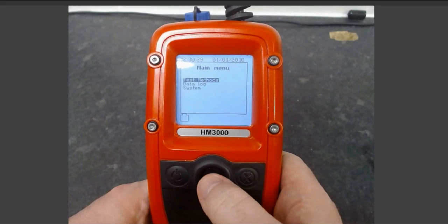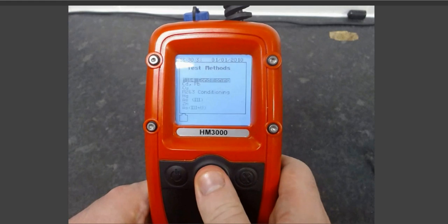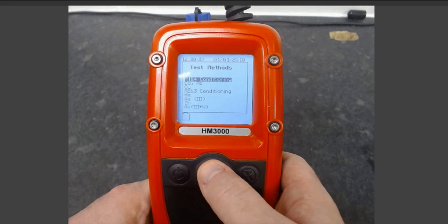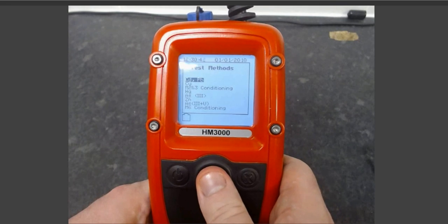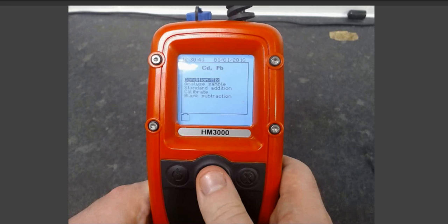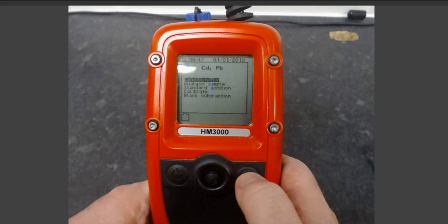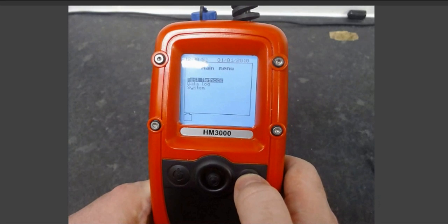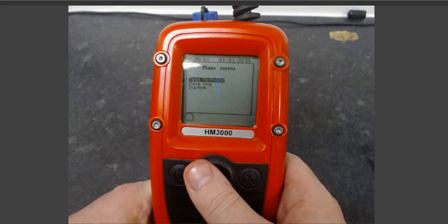You can also press the trackpad central button down, instead of as a switch, more like a button, and that is your select button. So if we were to press select again, it opens the cadmium lead menu. There's also this right hand button, which is your cancel button, which will take you back to the previous menu or cancel a process that is ongoing.